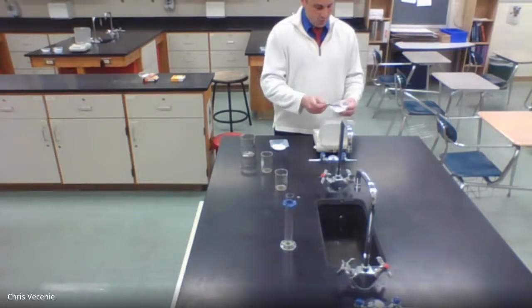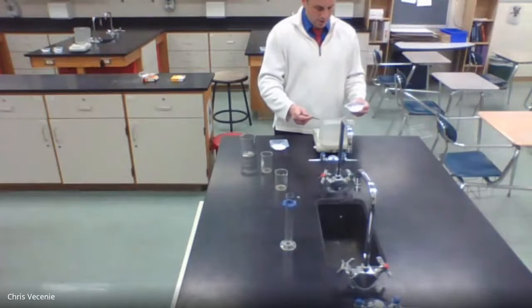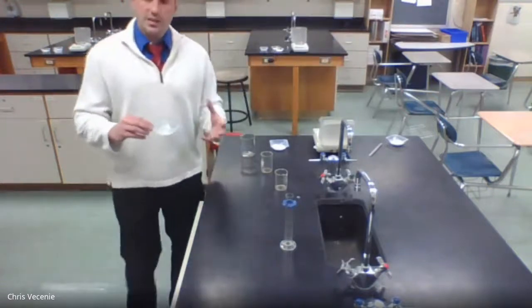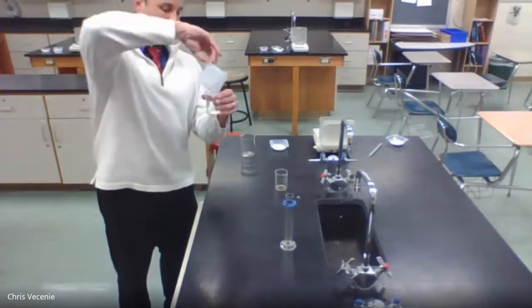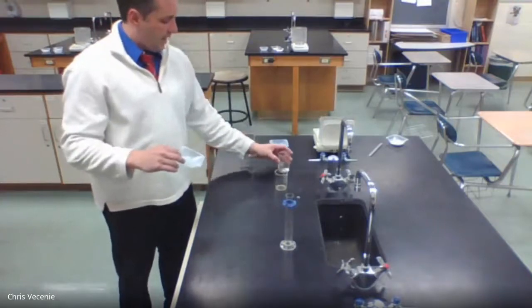This isn't one of those times where we want to just be near the amount, because we can take a subtraction to get it. I wrote 0.75 in your data table, so we need that to be the exact amount. There's the 0.75 of the Na2CO3.